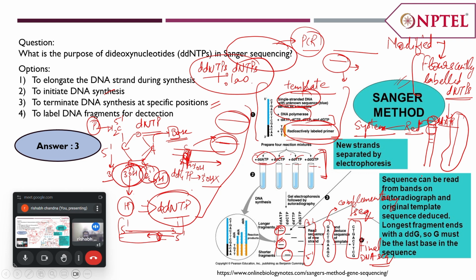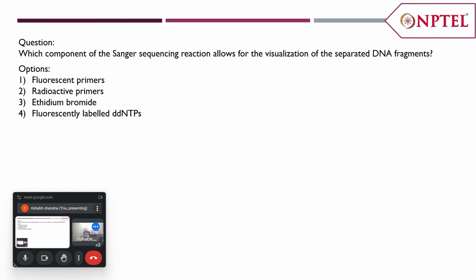Okay, so any doubts in this particular method? Okay, if not, then we'll move on to the next question. Which component of Sanger sequencing reaction allows for the visualization of the separated DNA fragments? What can be the correct answer?